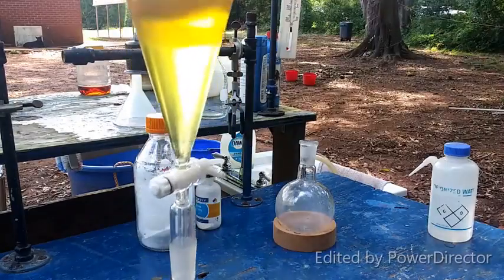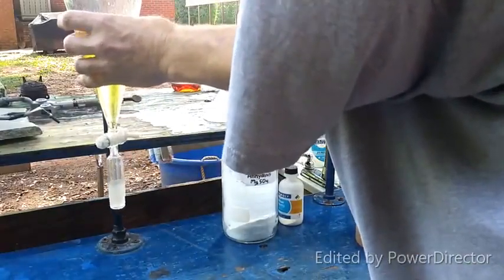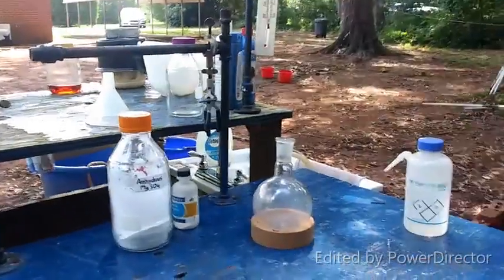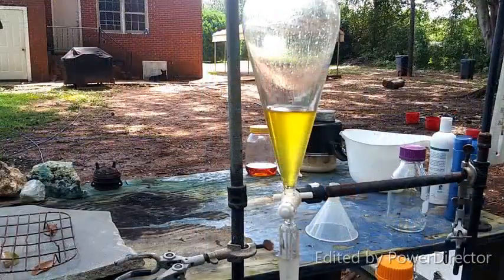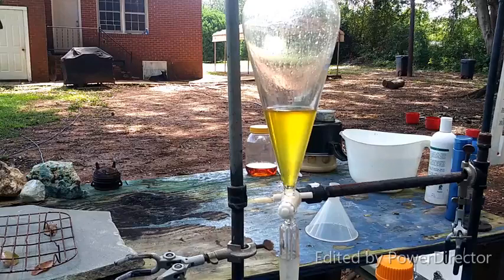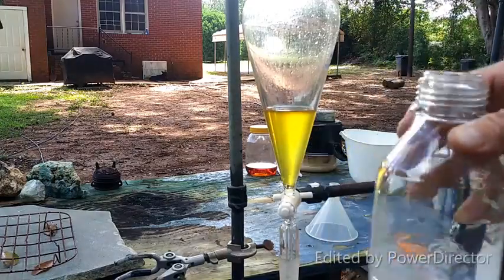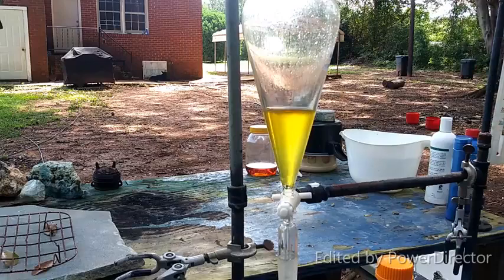Alright, now I'm going to let this sit here for just a minute so that everything can separate out completely. And I will come back when that is done. Alright, now the next step is to wash this with some aqueous sodium bisulfite in order to remove the iodine that is dissolved into the ether. I'm being lazy and using the ether jar. Alright. After all, it's not going to matter.